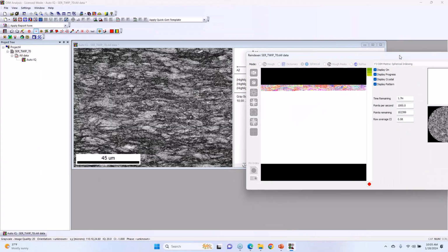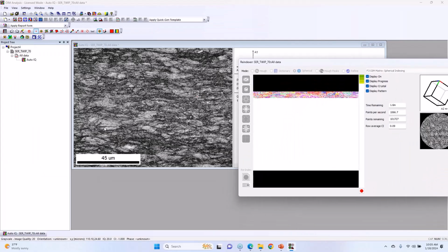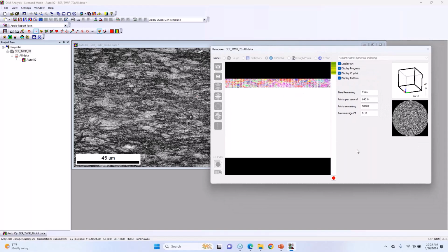So again, this is one where, with the steps, you can see these are really deformed structures. So usually I'd run NPAR both before and after to check this and see which one I like better.